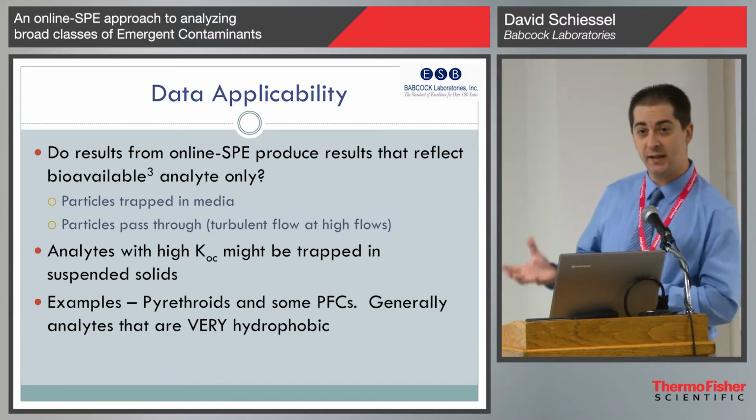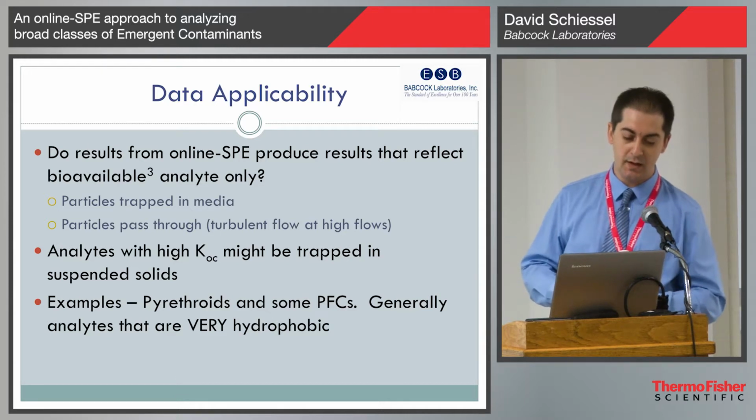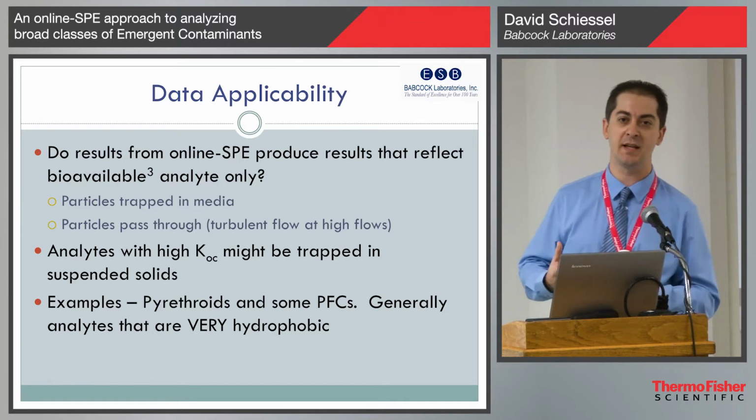One thing as far as online-SPE data applicability that's worthwhile to note is whether or not we're measuring bioavailable contaminants.